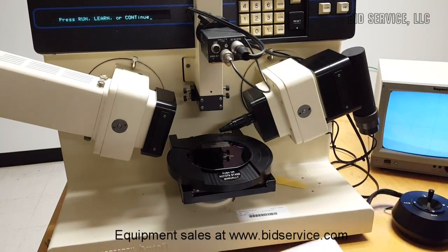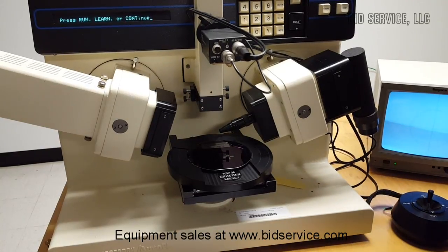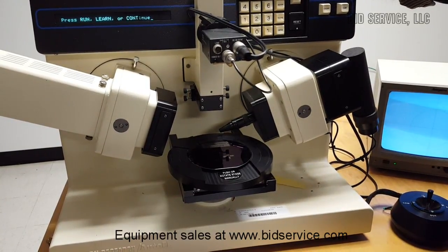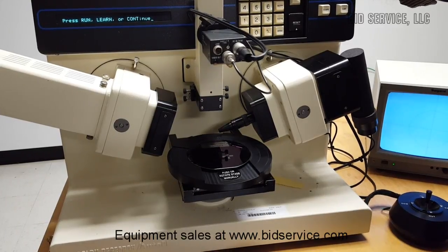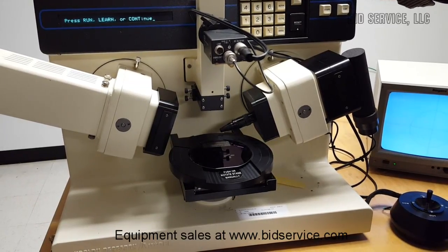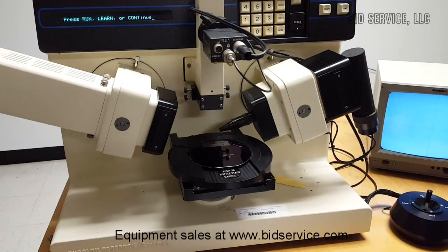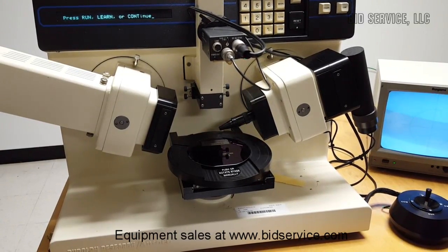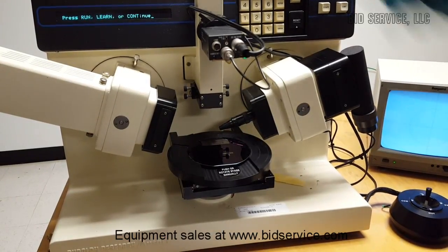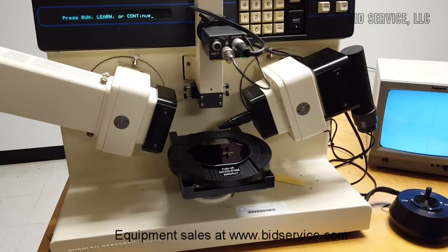For example, for a standard 6328 angstrom wavelength, there's a thickness called cycle thickness, which is 2825 angstroms. So up to 2825 angstroms, the system will display the thickness directly.